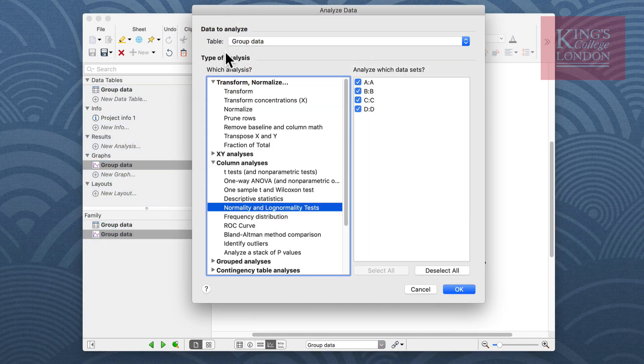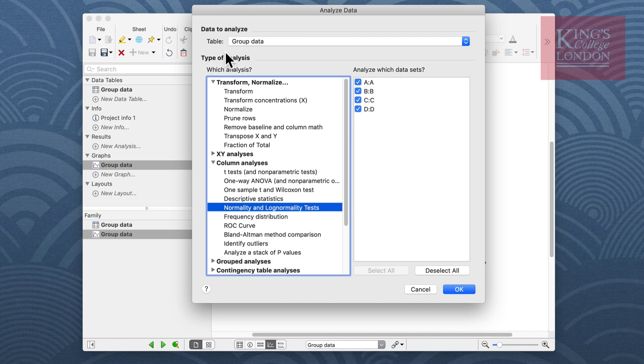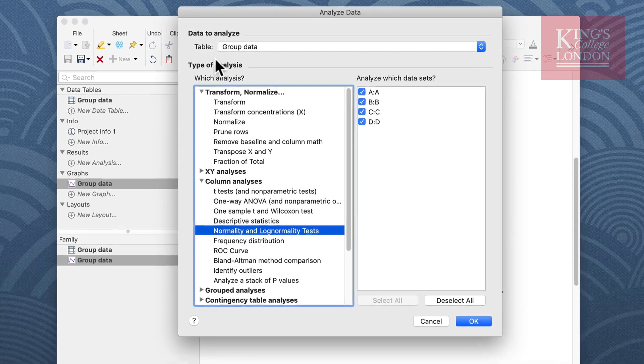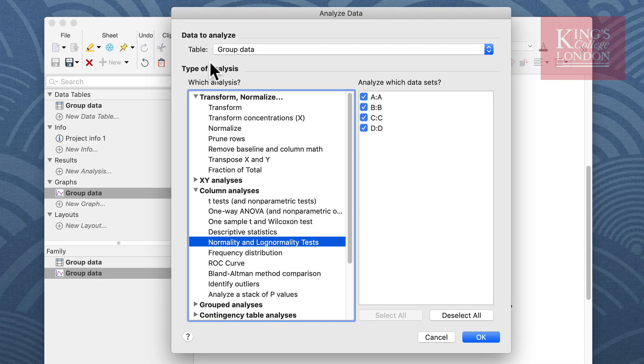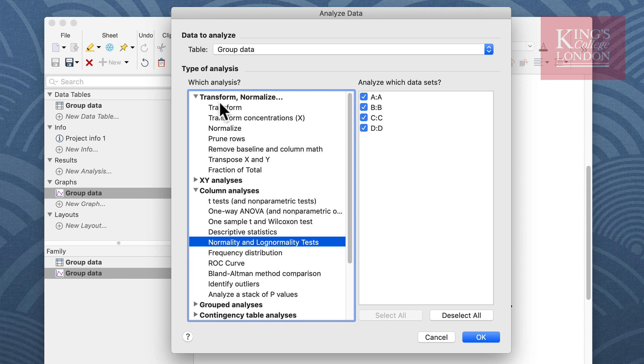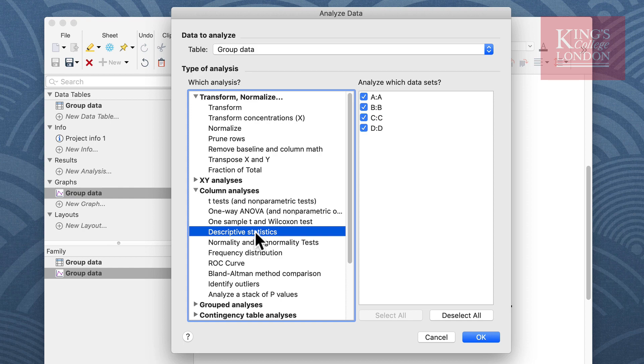When you click on the analyze data you get the analyze data option window and from here you can choose a number of analyses from the selection on the left hand side. I want to look at the descriptive statistics of these data so I'm going to click on descriptive statistics from the column analyses option.